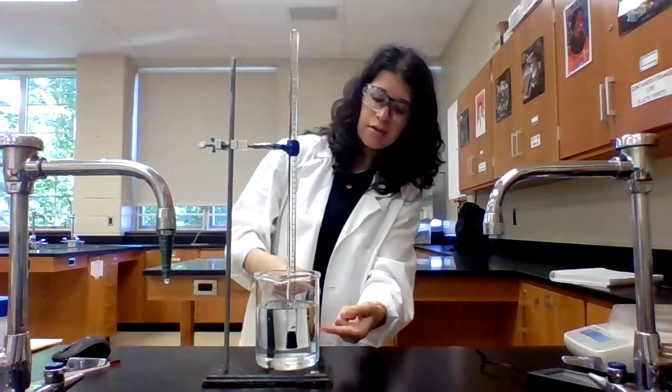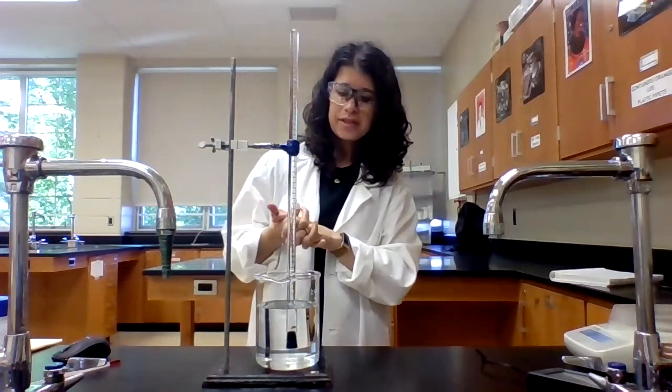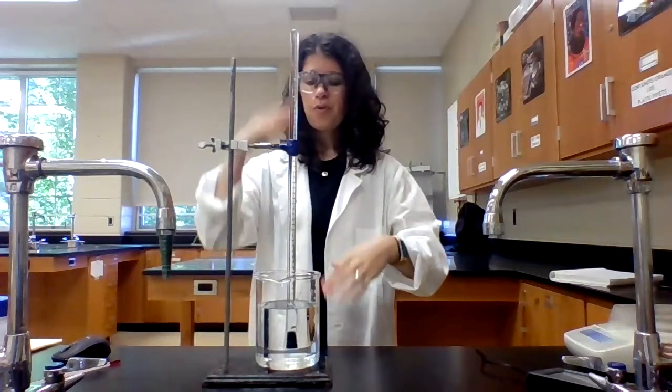So as the hydrochloric acid starts to make its way down to where the magnesium ribbon is, we should start to see bubbles form. And it's a pretty vigorous reaction, this single replacement reaction. So this is just going to take probably another 30 seconds to a minute for the hydrochloric acid to get down to the bottom and react.